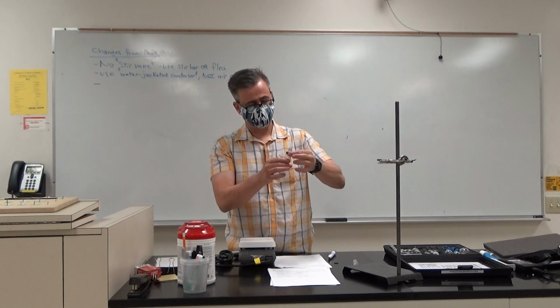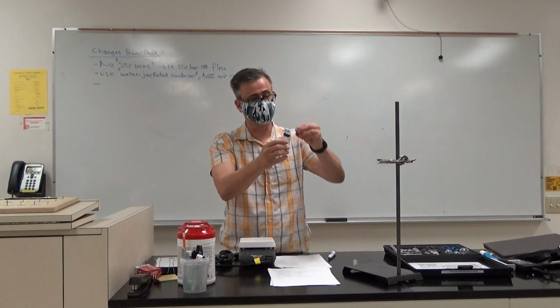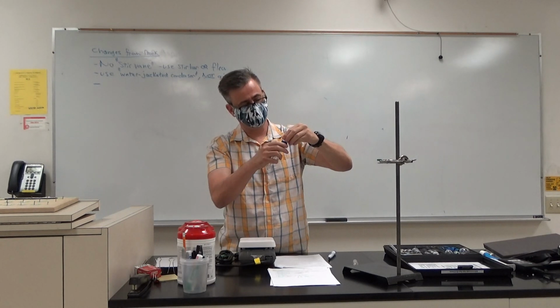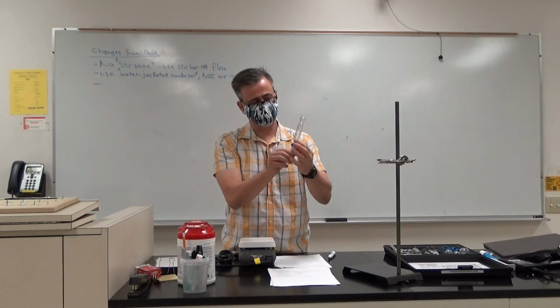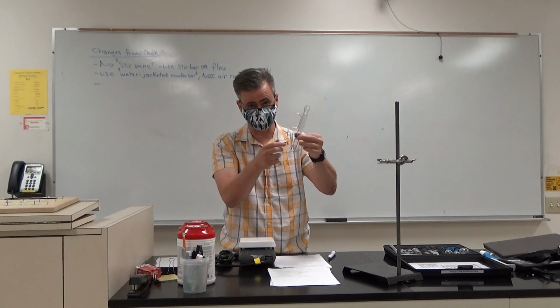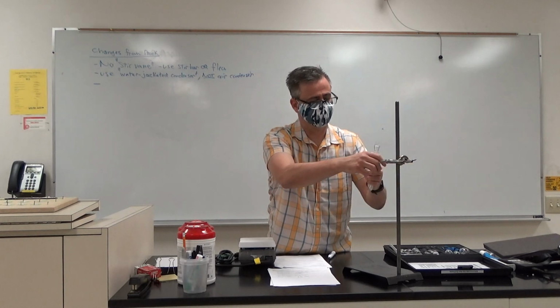You put the nut over that part, yeah? And then you roll this black O-ring over that. The black O-ring isn't in there, they're going to slip apart in the middle of your reaction, and you're going to be doomed. So you roll that guy over, okay? And then this guy screws on here, okay? I would have my stir bar, my stir flea in there, yeah? All right, and then open this guy up, okay?